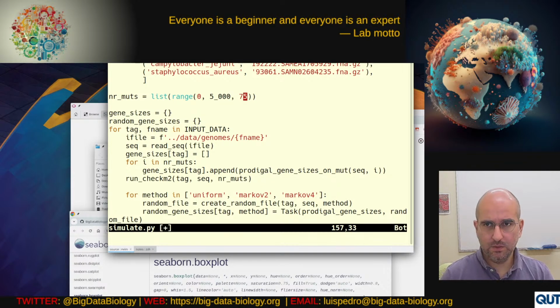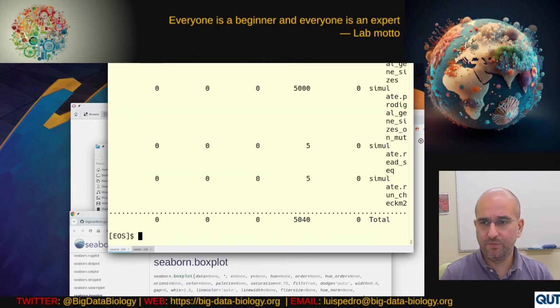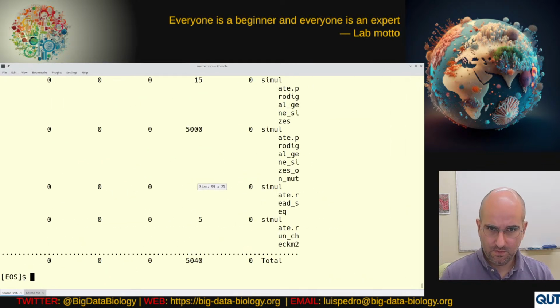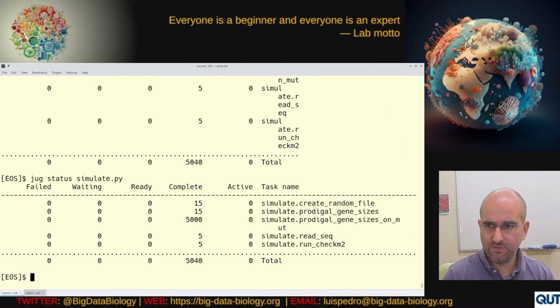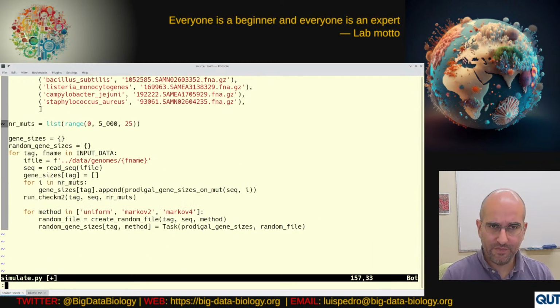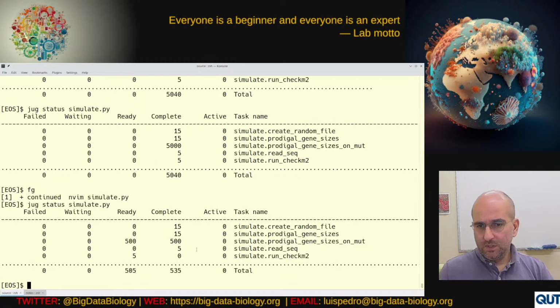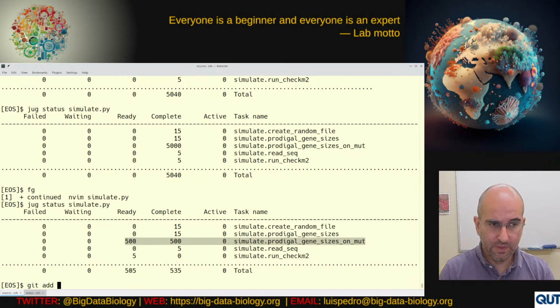and so just to show before I save it, everything has been run. There it is. Very nice. Now, after I save it, unfortunately, we need to rerun the checkm2 because it runs the whole batch at once, and then we need to run a lot of these. So I will do that off stream and then just show the results quickly in the recap.